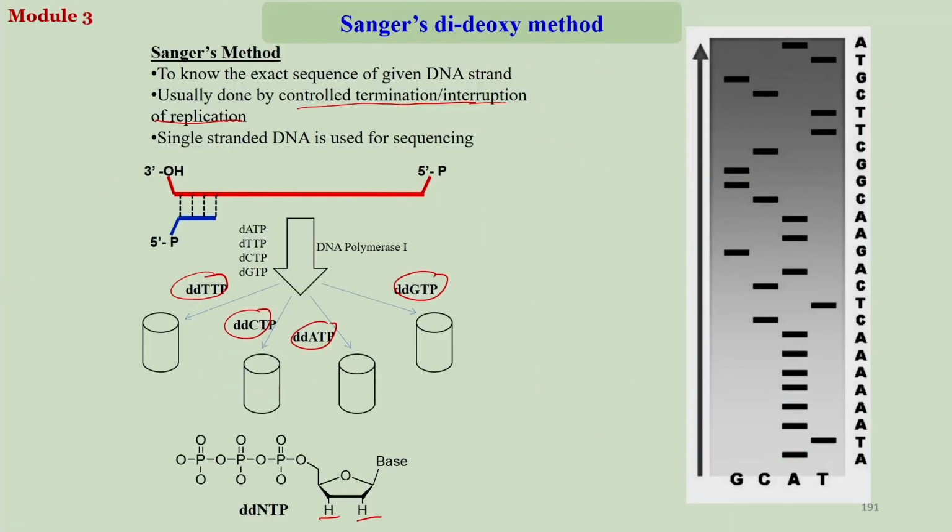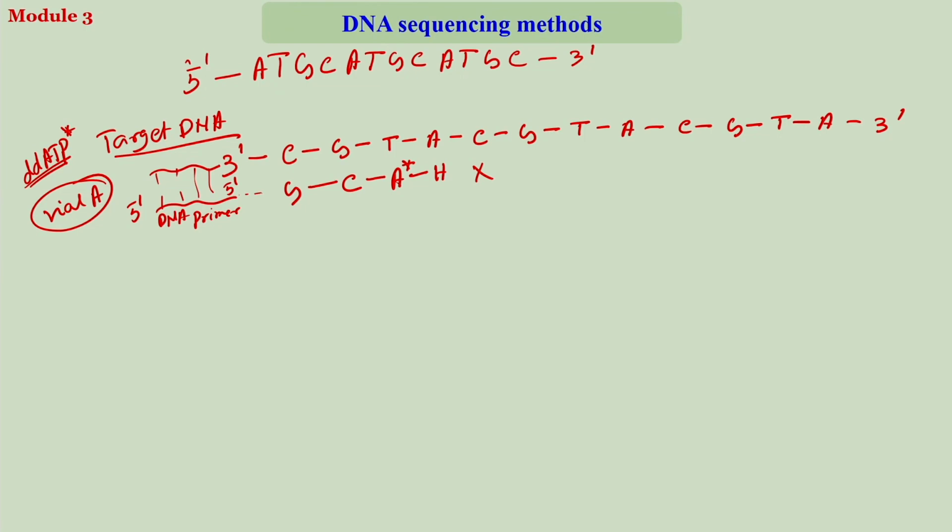So, if you have for example 100 or 200 copies of DNA at the beginning, maybe 10 copies of DNA will be stopped here and the rest, 90 or 190, will move along. That is where you get the more fragments.